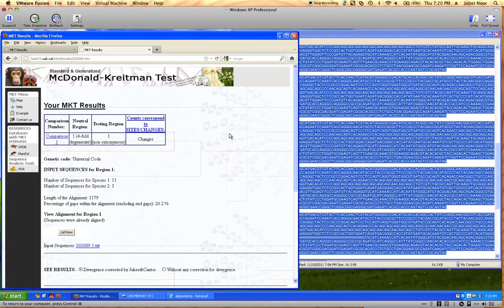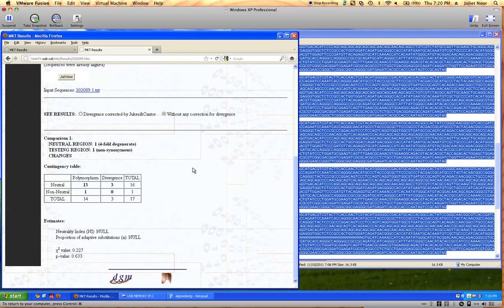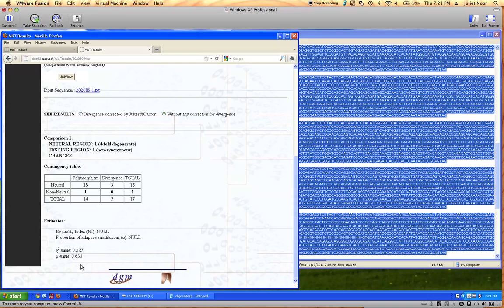Again, make sure you click 'Without any correction' so you have nice whole numbers. We didn't lose any non-neutral ones, of course, because that hasn't changed. We've just changed our definition of synonymous to be more limiting, so we have fewer four-fold degenerate sites than we had with all-encompassing synonymous mutations, and the same applies to fixed differences. Our NI is still null since we're still dividing by zero, but we still get a chi-squared and a p-value. The p-value is still very similar — this didn't change much. We still have no evidence that anything besides genetic drift and mutation is acting on this gene or its product.